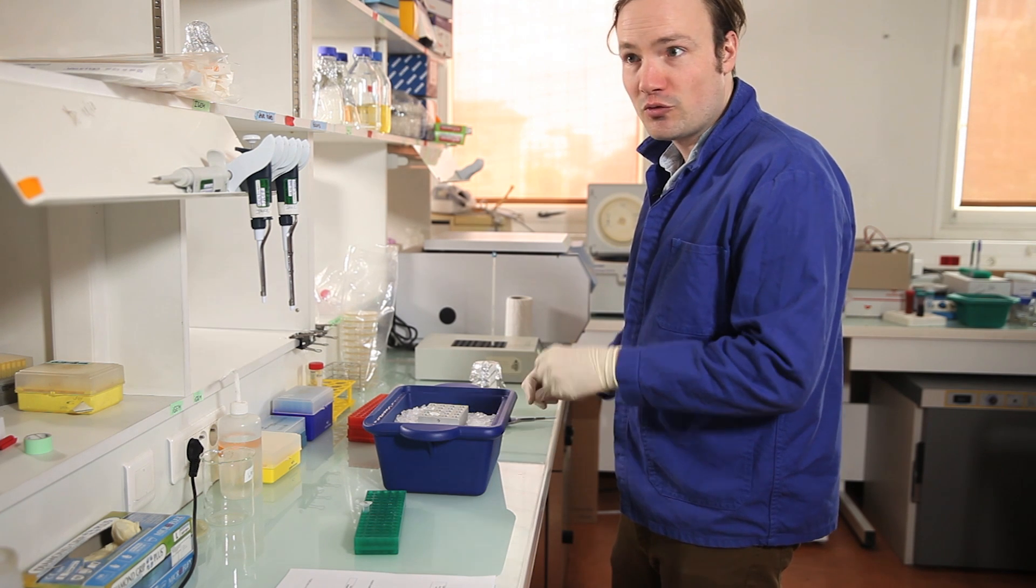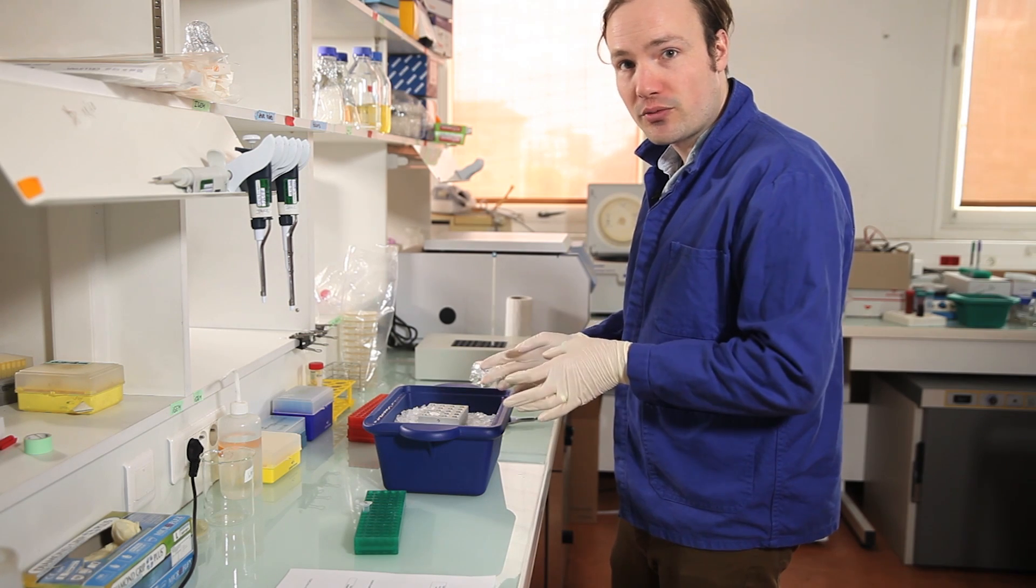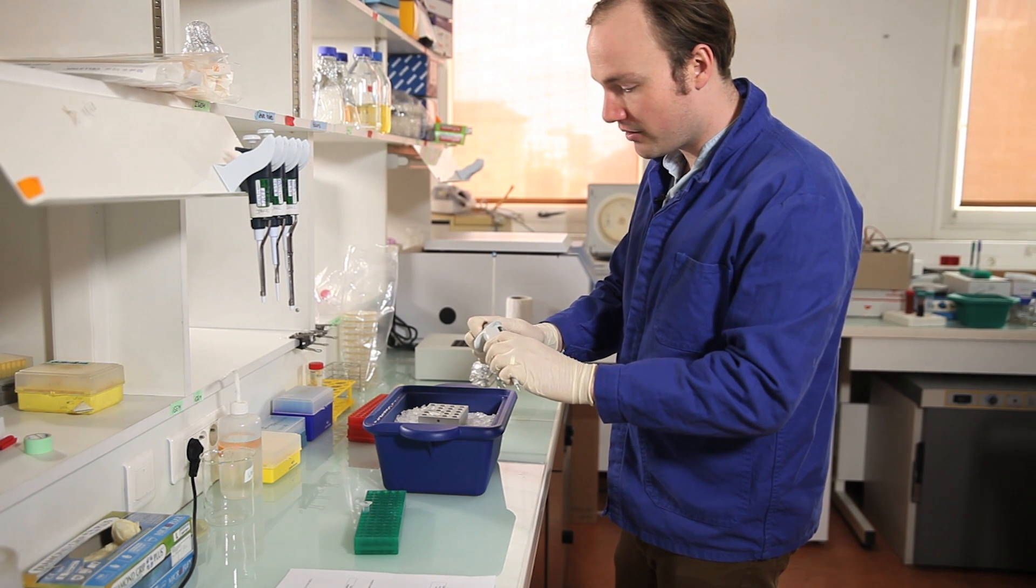If I was working with like a ligation product, for example, I would use a larger volume, maybe two or three microliters to get the number of transformers that we need. But for this, we just need a whisper, a whisper of cells. So we'll go all the way down to half a microliter.